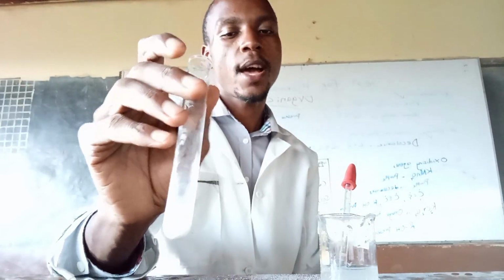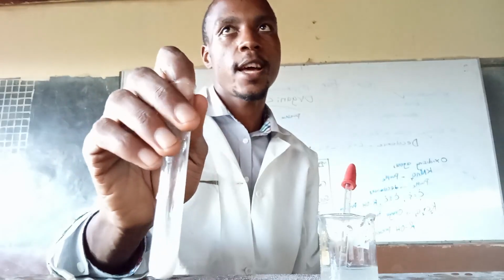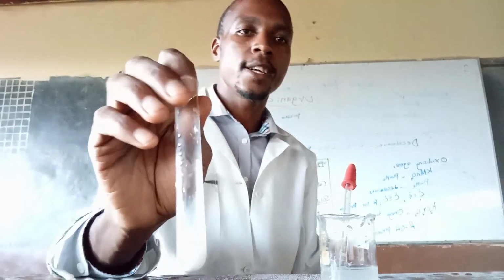That was test for anions. How do you differentiate between sulfate ions and sulfite ions? The answer is you simply add an acid like hydrochloric acid, sulfuric acid, or nitric acid.